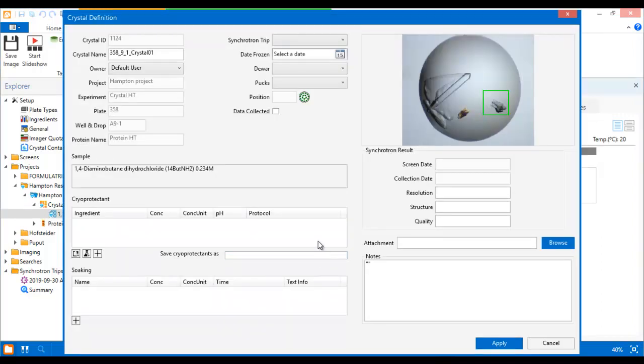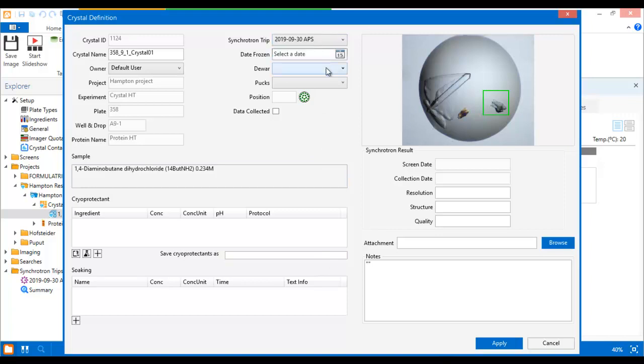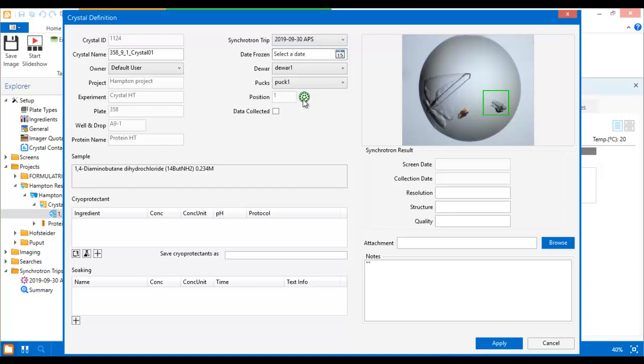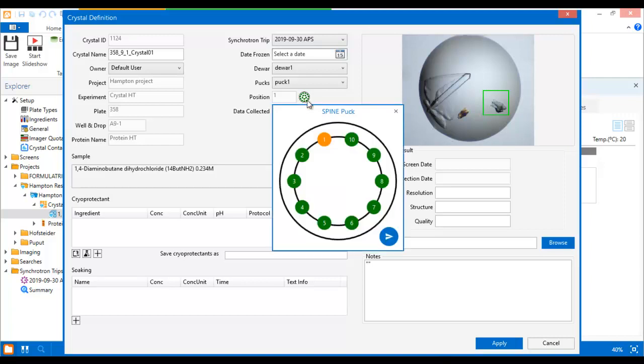When you virtually harvest crystals in RockMaker, you can assign them to a synchrotron trip, doer, and puck. RockMaker automatically assigns the position of your crystal to an available pin in the selected puck. To see this pin location or modify it, click the icon next to the Position field.